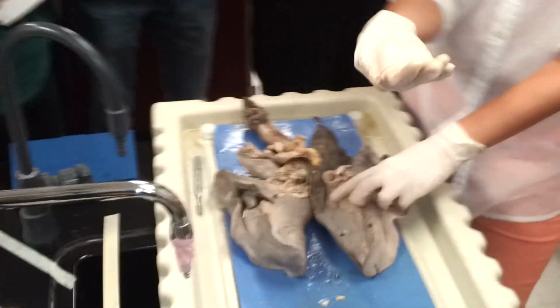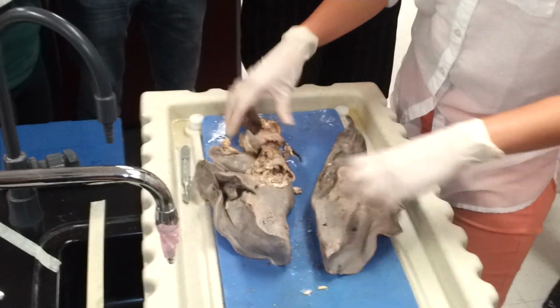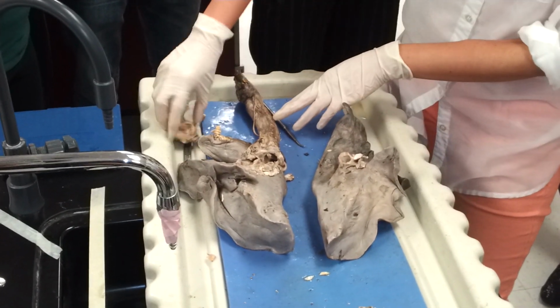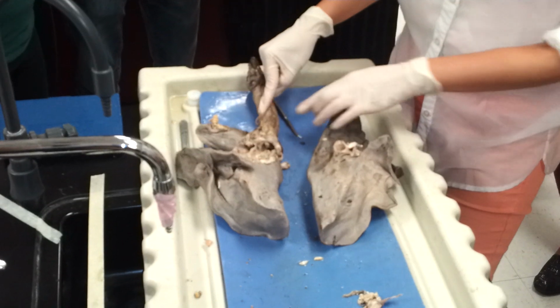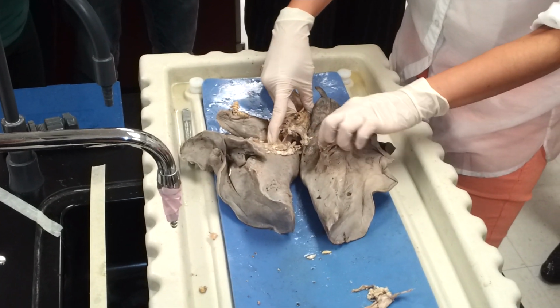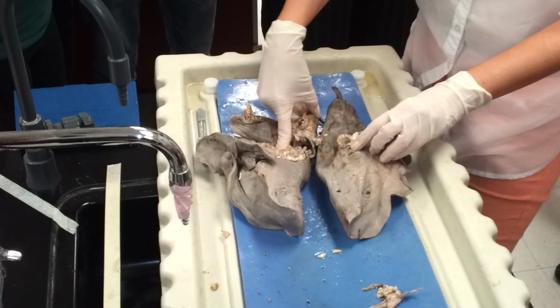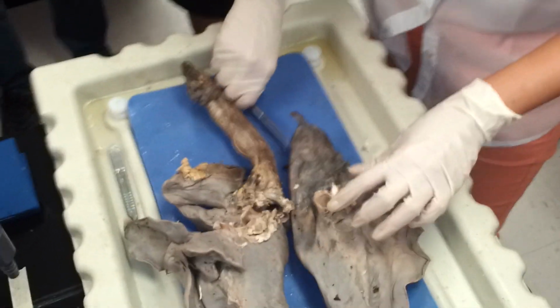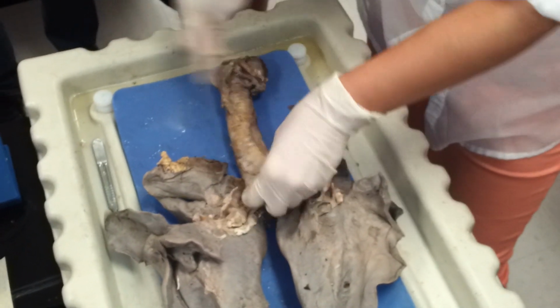But then he separated the lungs, and you can see that the trachea is going to connect and then split off into two bronchi. Right? There's the right bronchus, left bronchus. Okay? So then we do something like this.